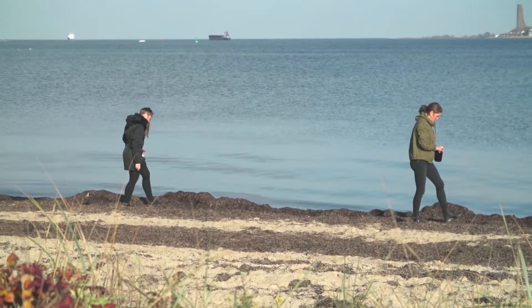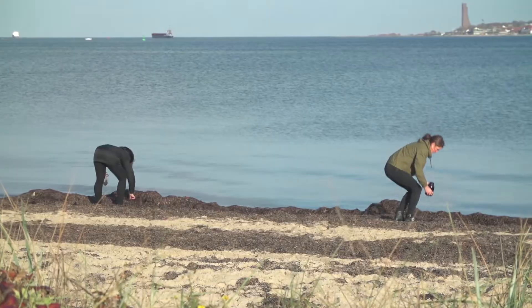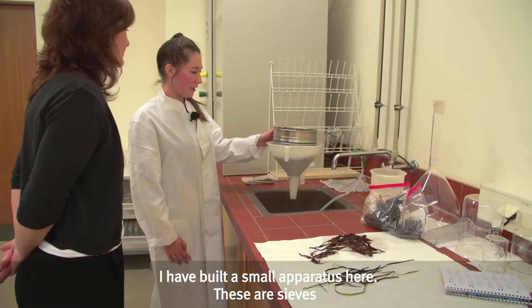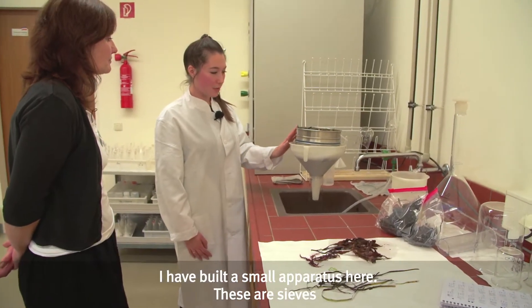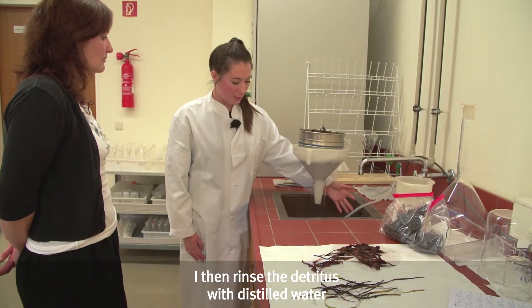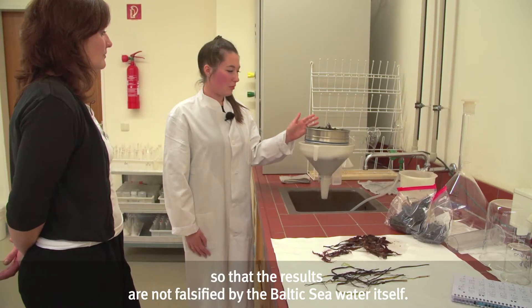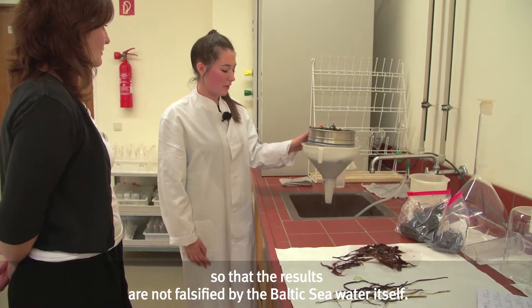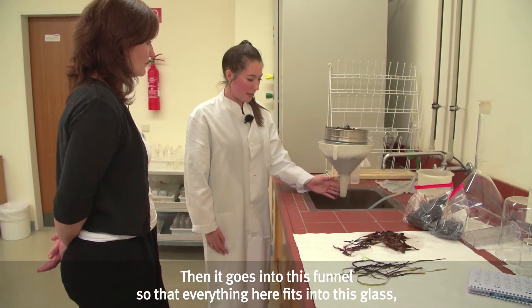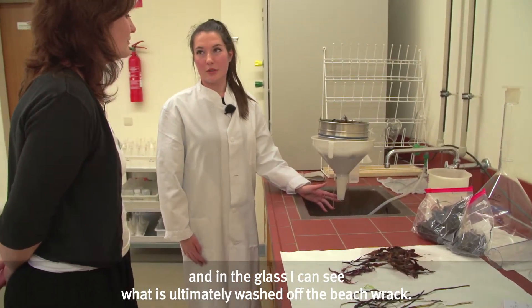The samples are taken from 15 locations on the Baltic Sea coast in Schleswig-Holstein and are prepared in the laboratory of the Institute of Geography in Kiel. Here I have built a small device — these are sieves so I can first see what washes off the drift material. I rinse it with distilled water so the results are not distorted by the Baltic Sea water itself. It then goes into this funnel so everything fits into this glass, and at the end I can see in the glass what has been washed off the drift material.